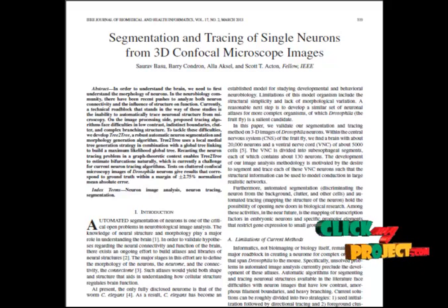In pre-processing, we remove the noise from the image and then we enhance the neuron image. Then we find the gradient of the image. After that, the binary image is generated for the neuron image. The binary image will be segmented by the Hessian based method. This method determines whether the pixel belongs to the neuron structure.